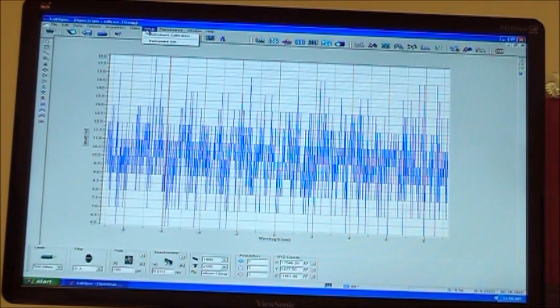Next over is a setup window. This is the setup window that the students will be using to do their calibration. There's an instrument init icon, which on this particular product line really doesn't do much. It would only move probably the two motors that you have on the notch filter and the motorized mirror, and that's it. It's more important on our other Aramis-based system because that whole system is full of motors. So this icon would be really important for that.